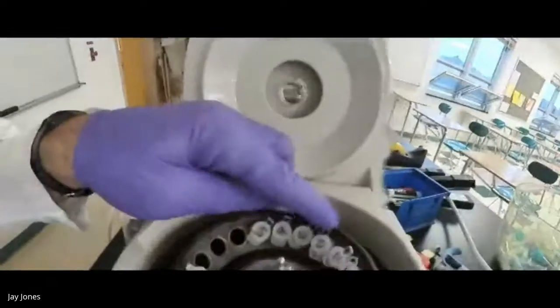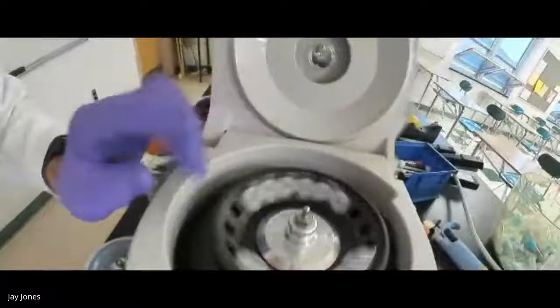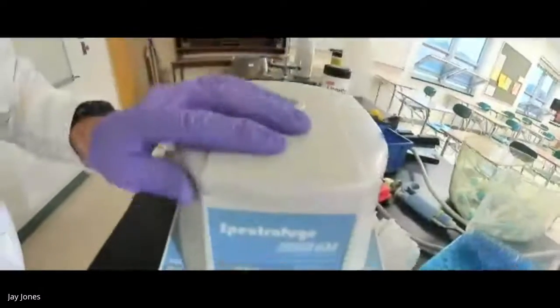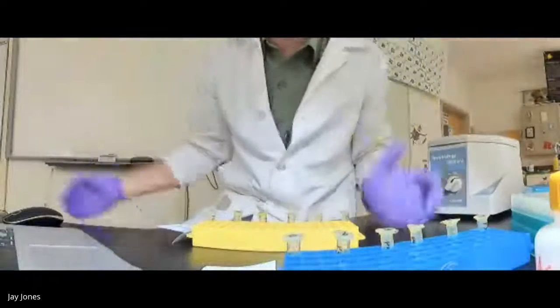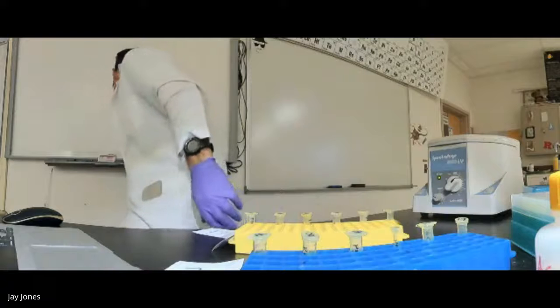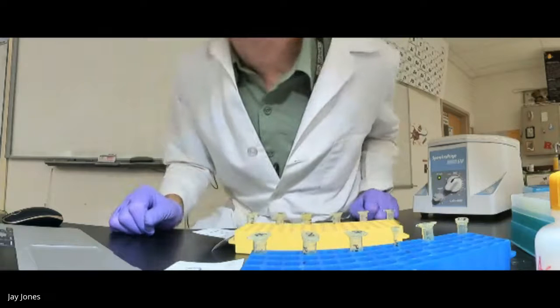I put all 12 spin columns, this is period 12, and this is you guys, period 3, in a balanced centrifuge. We're gonna spin these for a minute. We're gonna pull that liquid through. Ooh, that's too much. I actually have it for 2 minutes. Yeah, we'll let it go for two. All right, you get a 2 minute break. More really can't hurt. Okay, 2 minutes. You can fast forward the video 2 minutes.